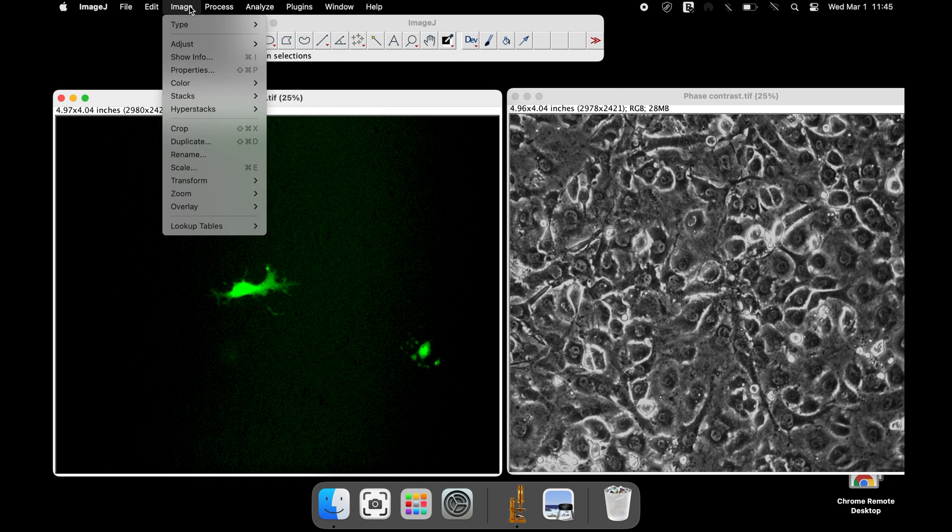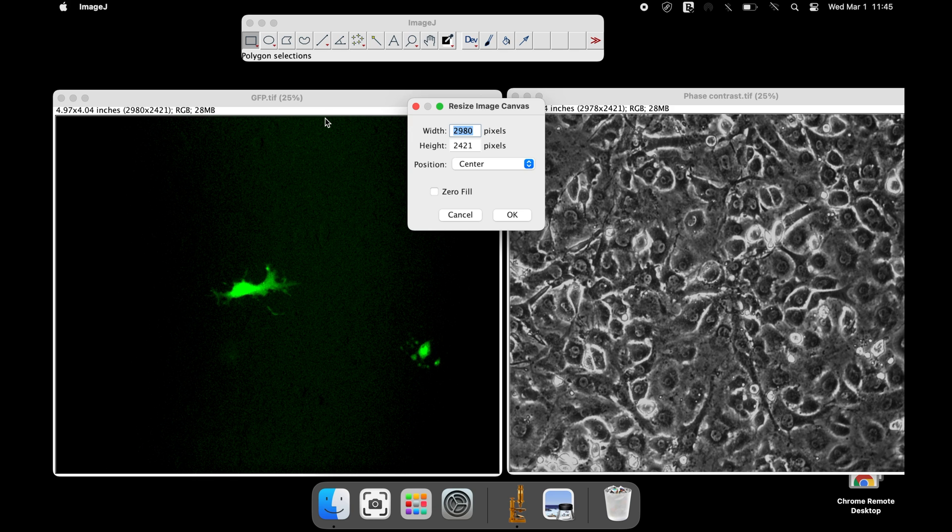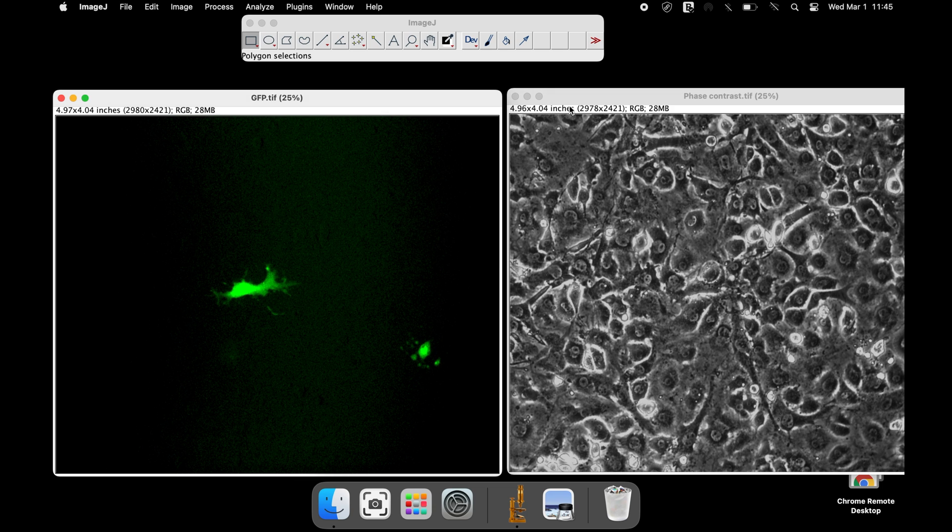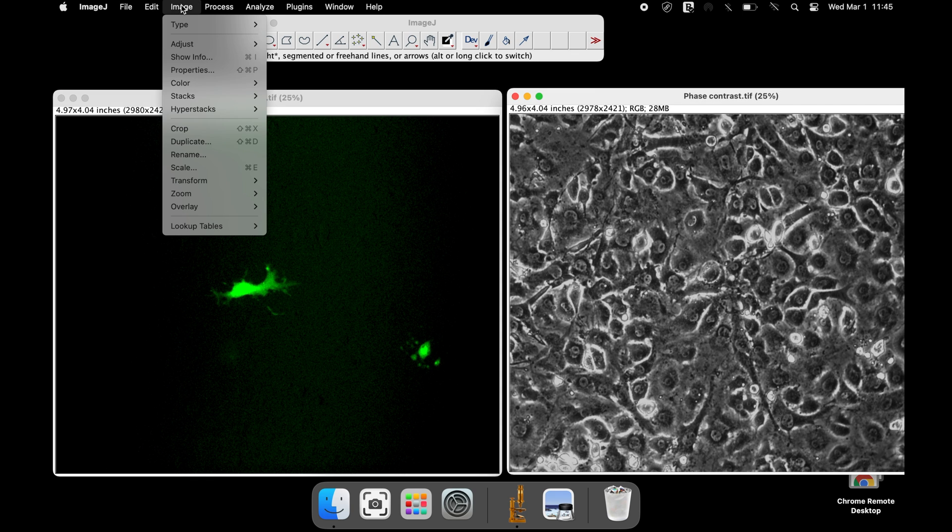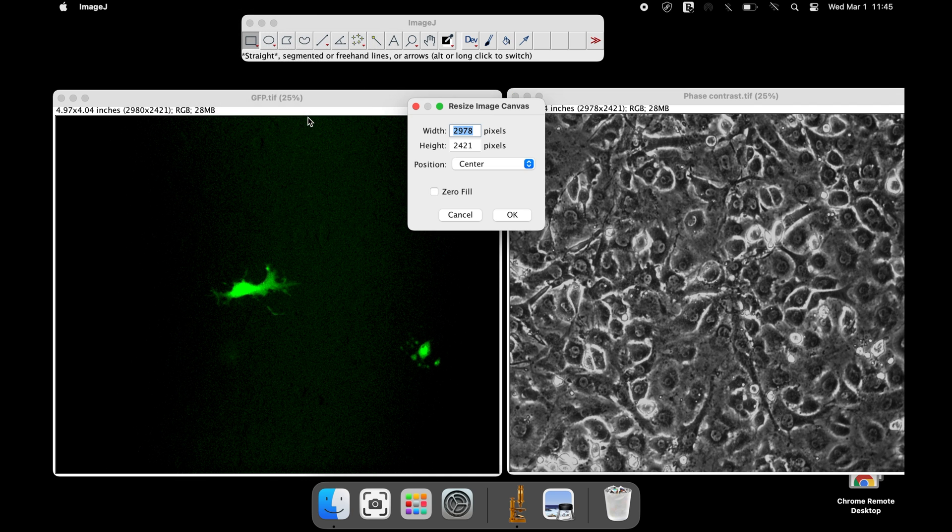Here, the image width is 2980 pixels and the height is 2421 pixels. Similarly, let us check the image size of the phase contrast image. Here, the image width has a different value as compared to the previous GFP image.